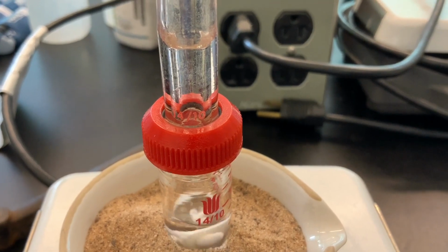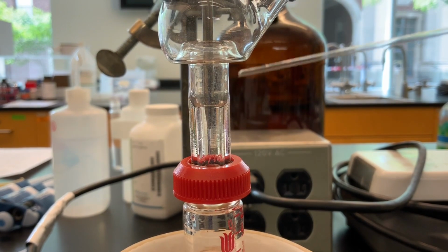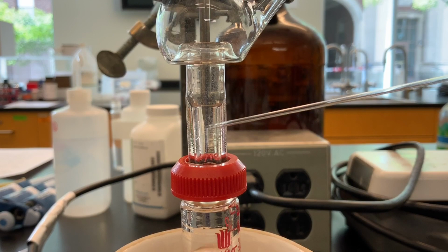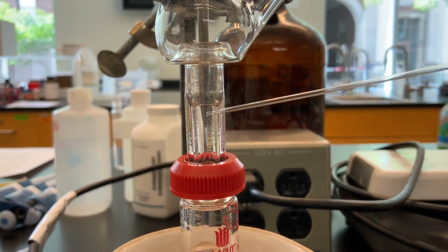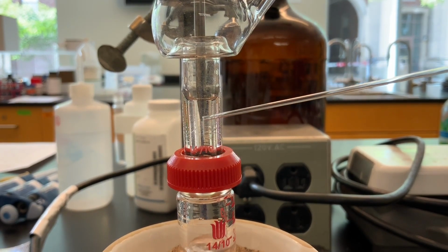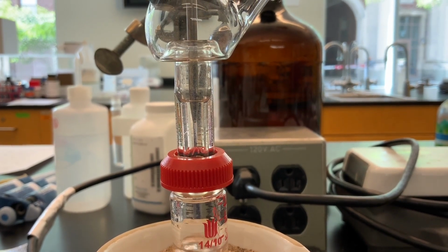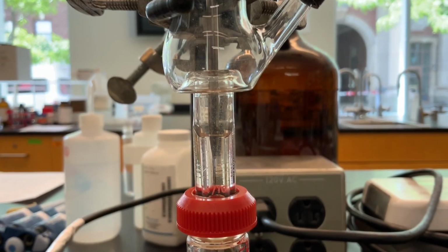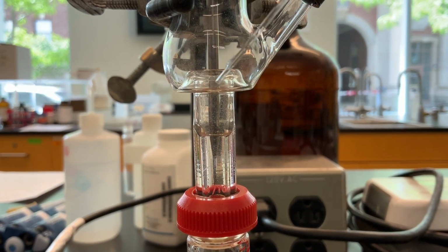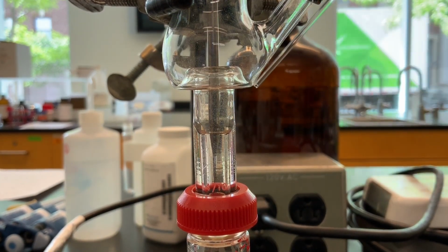But once again, our thermometer probe right here, right down in the throat of the stillhead, once the vapors climb to that region, it will start condensing on the probe itself, and that's when we're going to start measuring. We'll be able to tell the boiling point of the vapors, and then finally, once it starts to reach the well of the stillhead, that's when we're going to start recording the range of our boiling point.